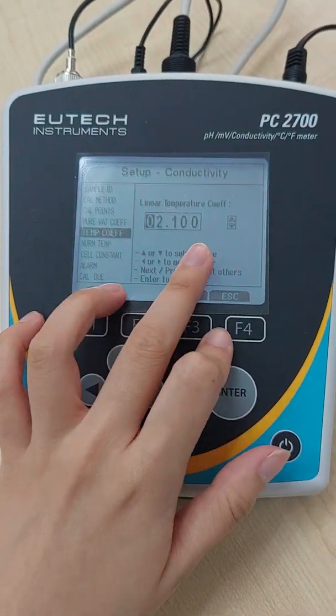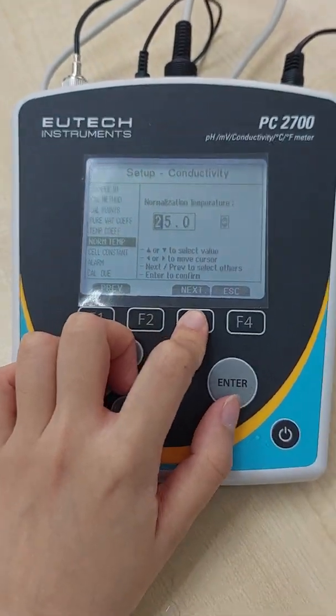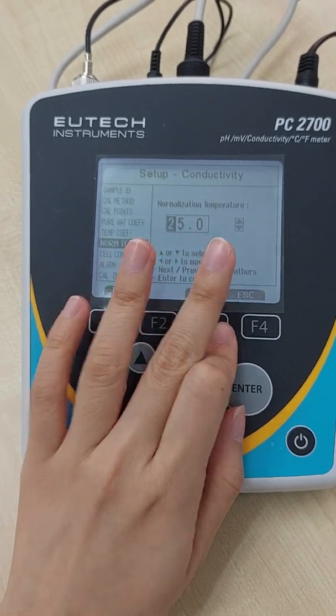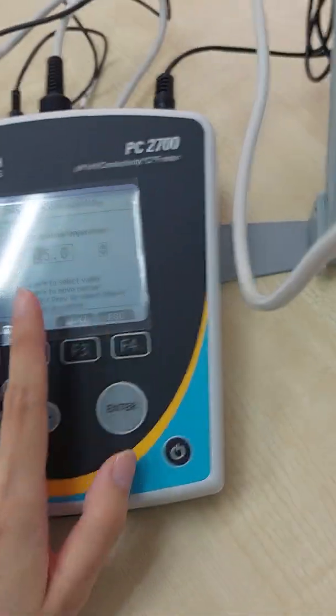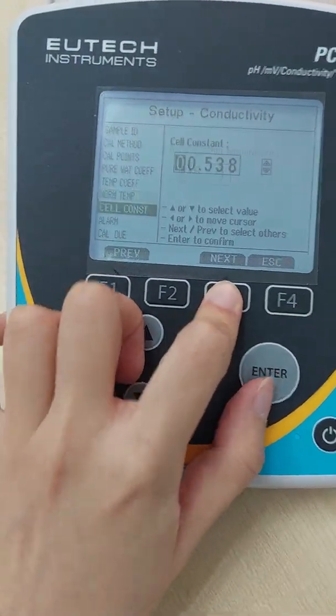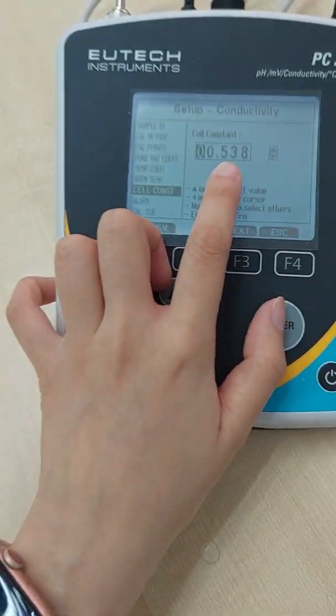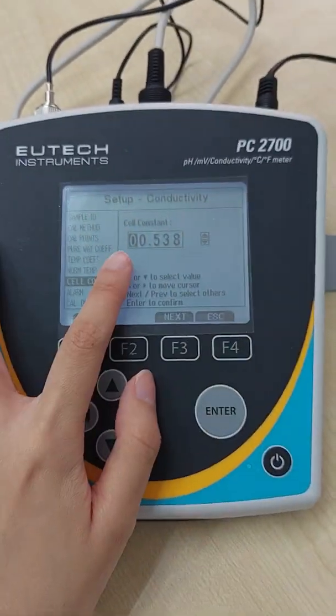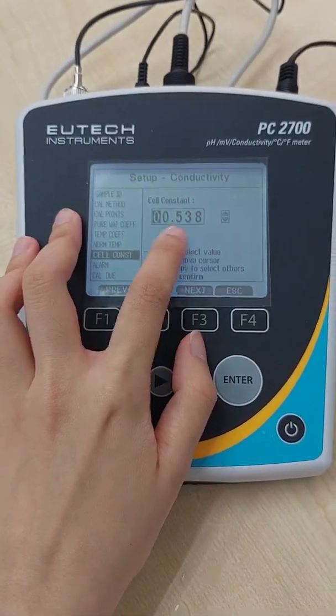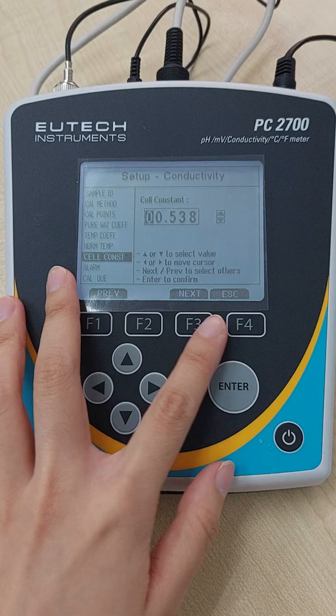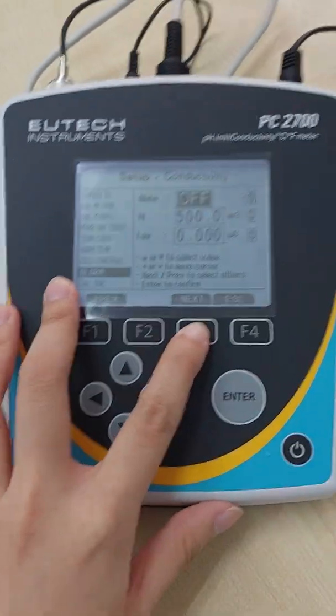Temperature coefficient, we just leave it like this. Normal temperature, we don't have to set because we have the electrode. So constant, this is the one that can be found on the conductivity probe, but for this meter they already pre-set it for you, so you don't have to do any adjustment.